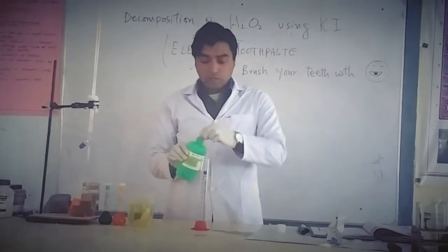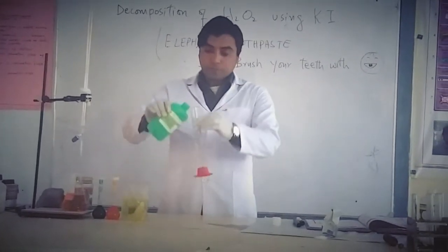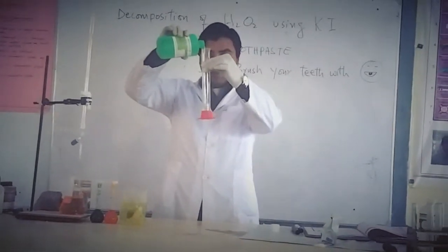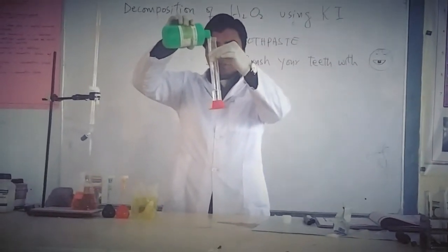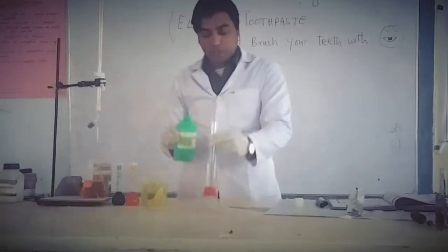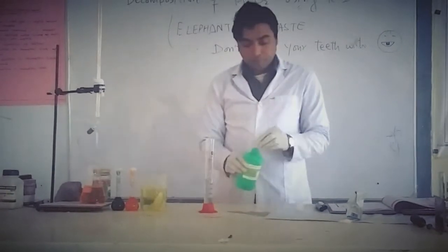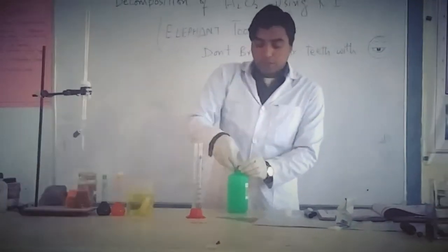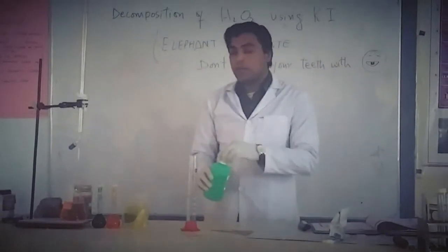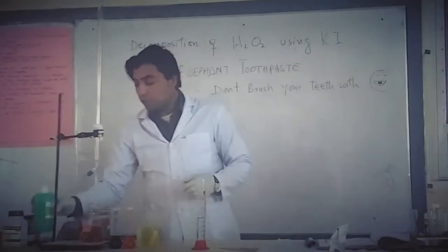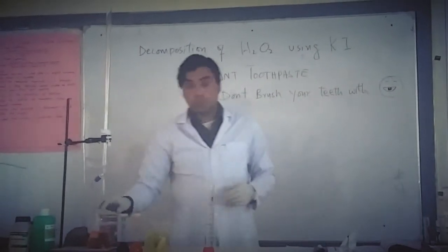First of all, we are going to add hydrogen peroxide — 60 ml of hydrogen peroxide. Hydrogen and oxygen bonds are weak, which is why hydrogen peroxide decomposes.